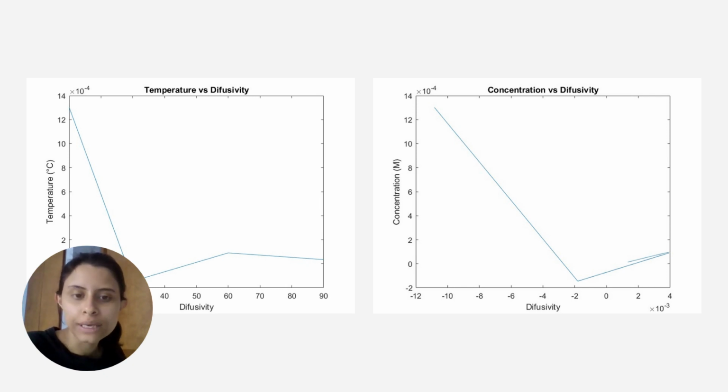By understanding the peak that was shown at approximately 610 nanometers, it was possible to get the concentrations and the diffusivity coefficients at the different temperatures. This was done using the simplified Soret equation. As was explained in the methodology, the velocity term of the equation is not considered because the system is at a steady state. The thermal diffusivity is also not considered because there is no temperature gradient inside the beaker. And the gamma coefficient is not considered because there is no thermodynamic relationship between the components in the system.